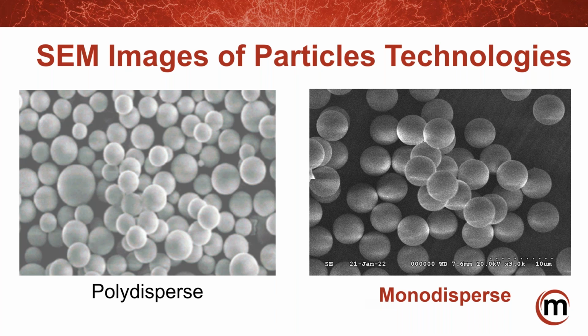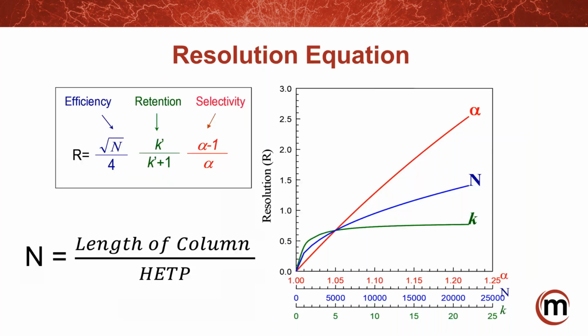So visually, you can sort of see this. This is the SEM of one of those materials. You can see there are big spheres and little spheres on the left, that we're now classifying as polydisperse material. And so moving forward, let's say 2022, when this material came to market, we can start classifying it in its own breadth.